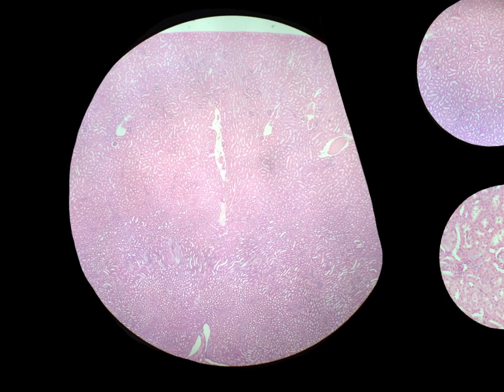What we're really looking at instead is actually just the difference between the cortex and the medulla of the kidney. And if you can see, right around here, the tissue really transitions. Up here, you're going to see these little circular structures right here, and here, and here. Here is a couple there, and there, and there. And so you can see those all right now, and I'm going to remove the drawing just so that you can see them without the aid.